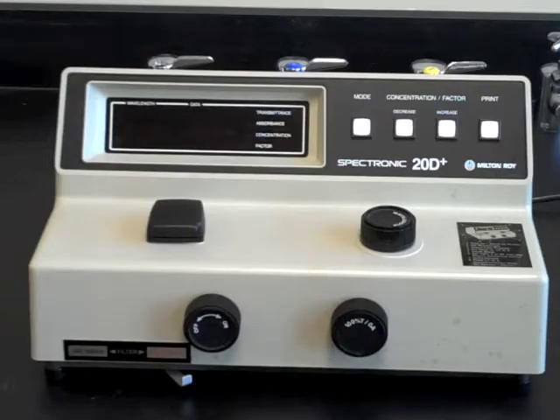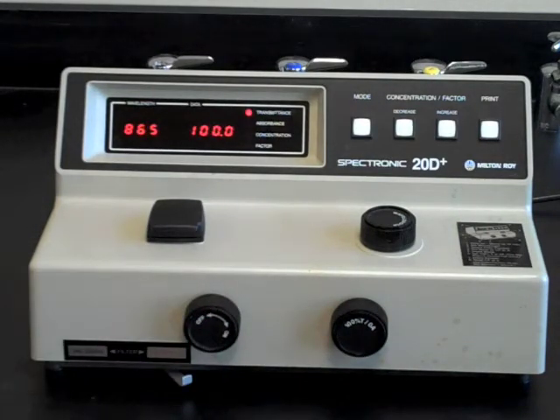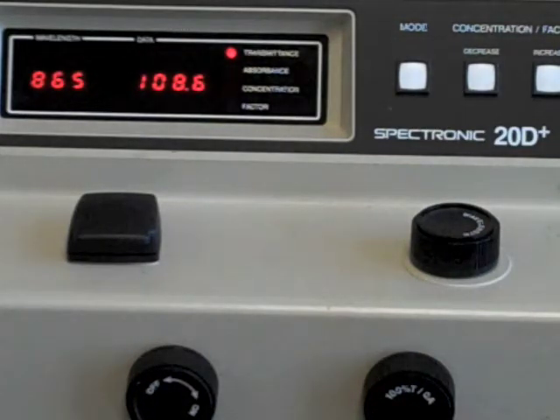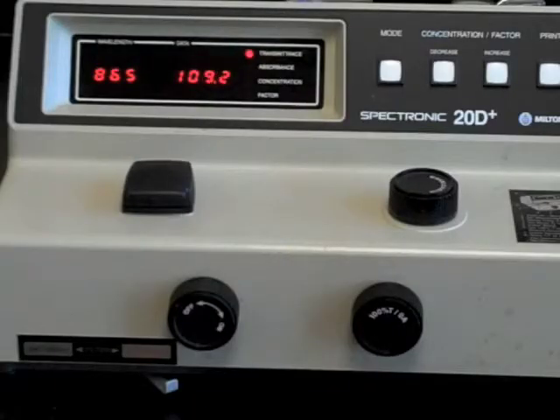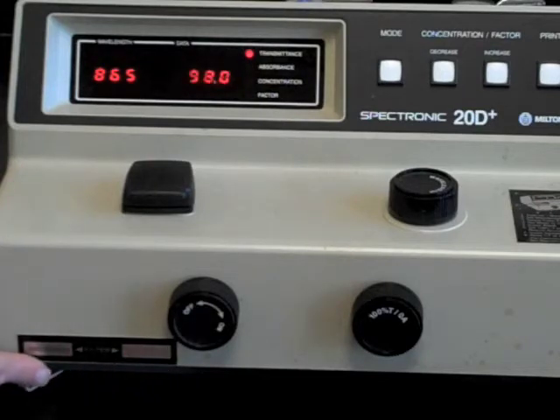Turn on the instrument with the knob on the left hand side of the front end. Because this instrument uses a grating, a filter is needed to help isolate wavelengths longer than 600 nanometers. Move the lever on the lower left hand side of the instrument to the left to remove the filter, since we will be working at 525 nanometers for this demonstration.